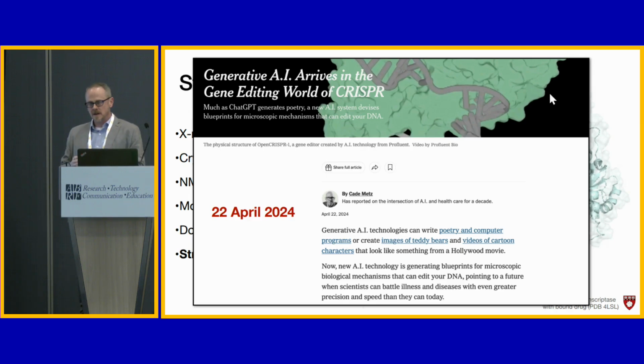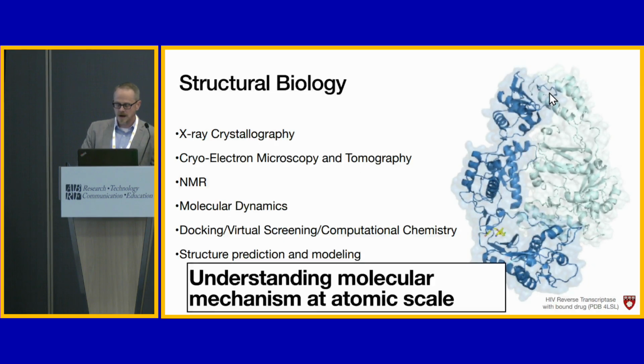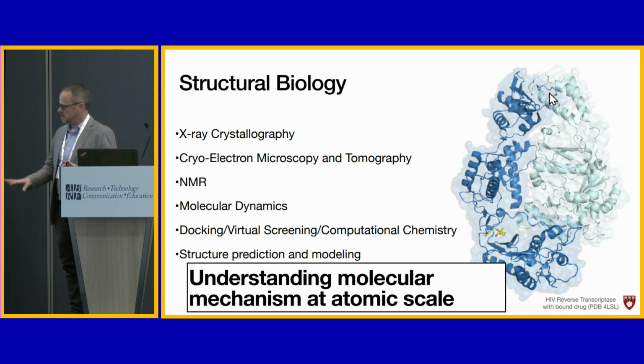They use a similar set of architecture to cryo-EM. They need GPUs. They need a lot of storage. They need performant computing. So we're adding these all the time, and the whole goal here is understanding molecular mechanism at atomic scale. So that's what we do. That's what we want to help researchers do.